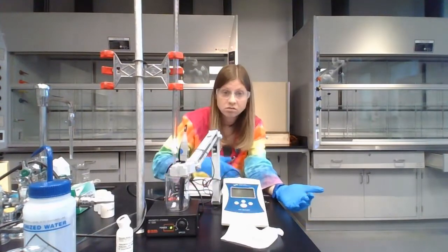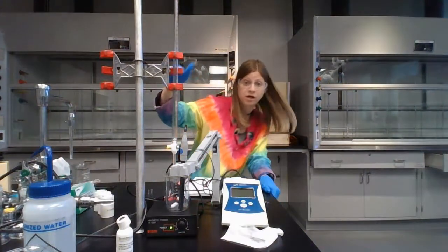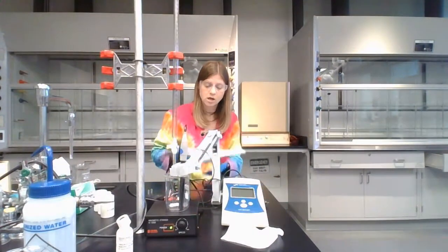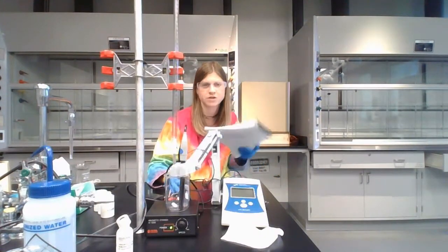So you're going to keep doing 1 milliliter increments: 0 milliliters, 1, 2, 3, 4, accurately recording the level on the burette, and then recording the pH until we get to where the pH stops changing. That would mean two pH values that are right next to each other.